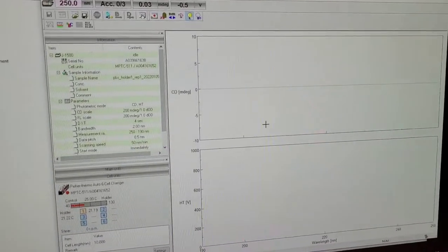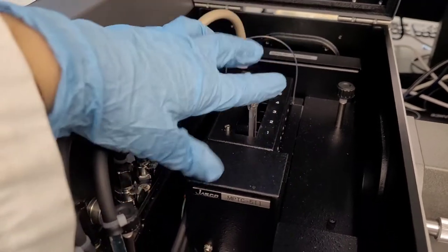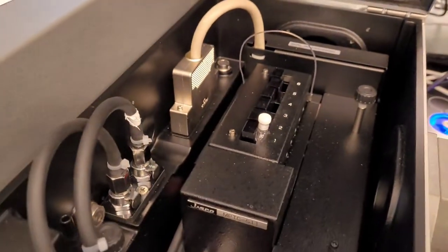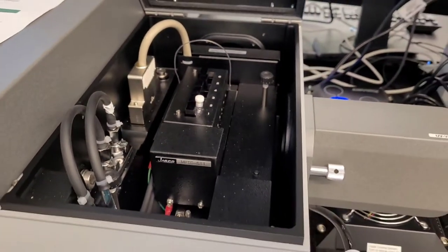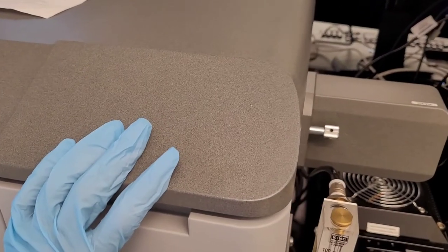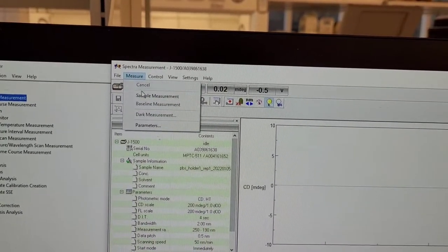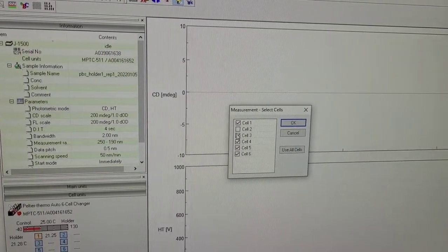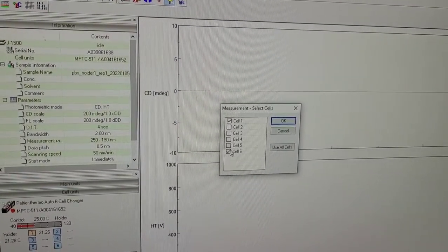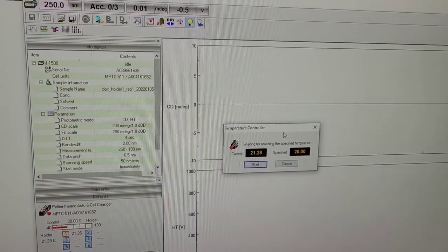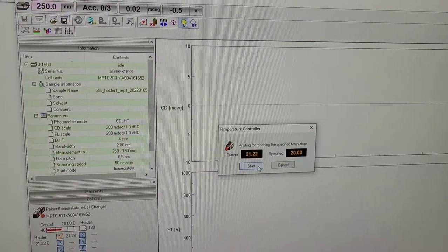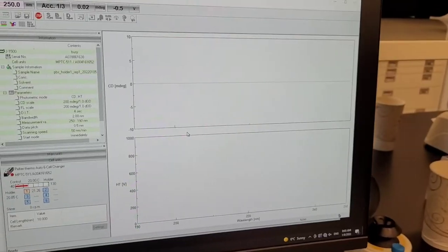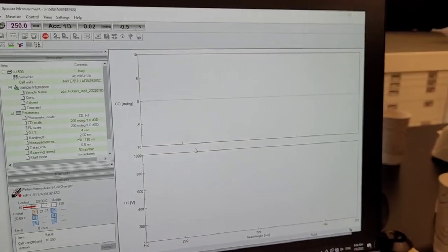So once that's done, put your sample in. Yeah, definitely don't forget to put your sample in. It sometimes happens when you might forget and you see no signal for no reason. Then go to measure, sample measurement, select cell one only. Start because I just want to see that everything is okay. I'm not saving this one.